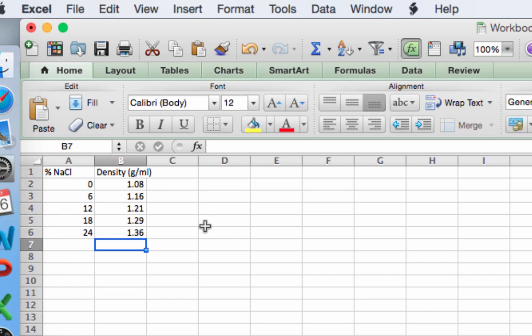Okay, now that I've entered my data, I want to prepare a standard curve. Remember, with your data, you're going to have more than one measurement for each percent sodium chloride sample, and so you can just enter those again below, like 0 again, 6 again, etc. I'll just omit those for now.